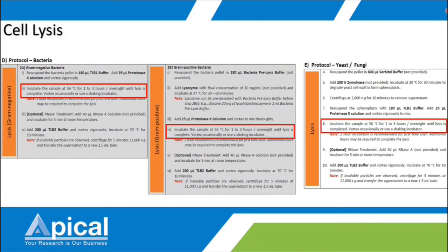But as mentioned just now, fungus cell membranes are quite varied. So you may need to take some time to optimize the incubation period for different types of fungus. This is applicable to most of the commercial kits that you are using. So for fungus, you need to make some optimization on the incubation time. Okay, and one more additional tip.